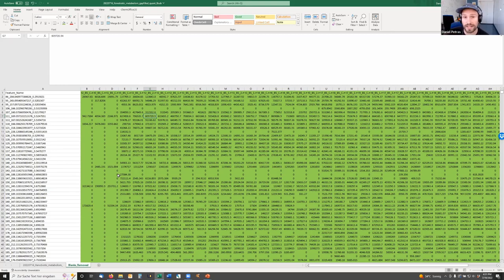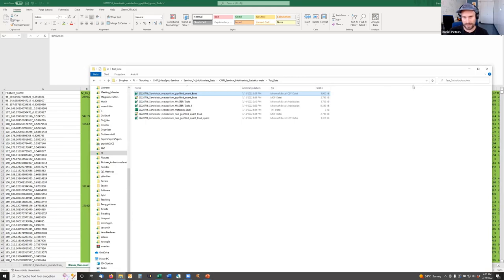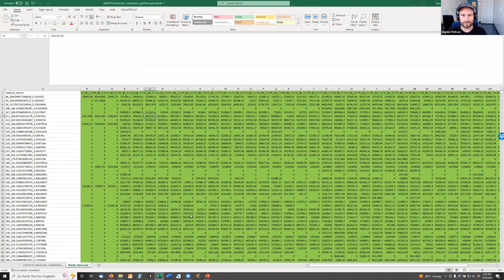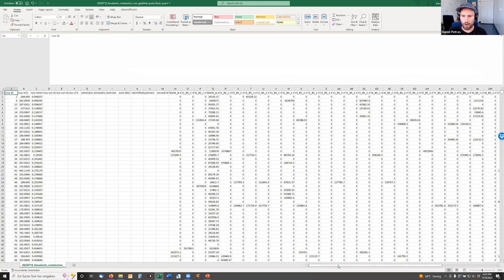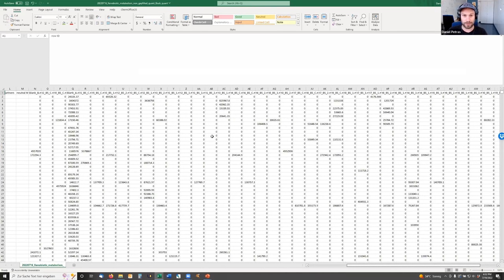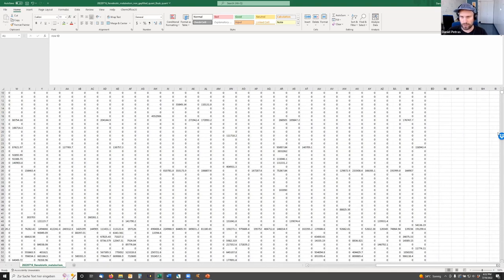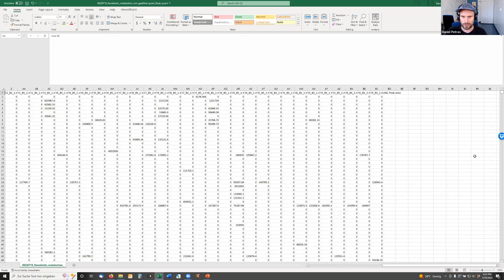The question is: what is that LOD? My assumption is to pick the smallest peak area in the non-gap-filled feature table that was naturally detected — that's why we need the non-gap-filled file. In Excel, I'll open the non-gap-filled quant table and use the FREQUENCY function to look at the distribution. To use it, I need to define bins — categories like 1, 10, 100, 1,000, and so on. I'll write a quick formula multiplying by 10 to generate these bin categories.